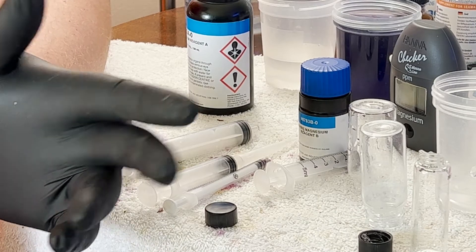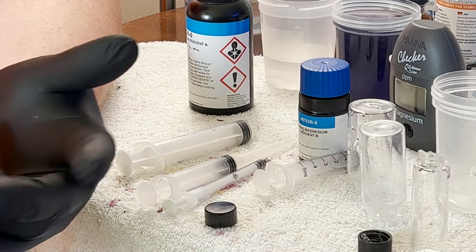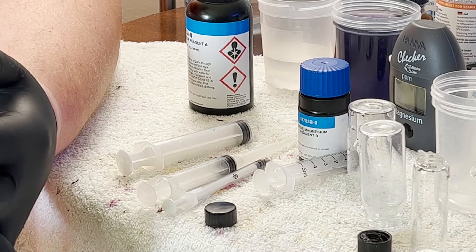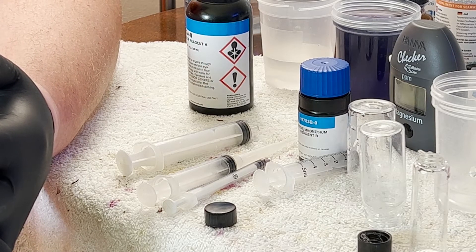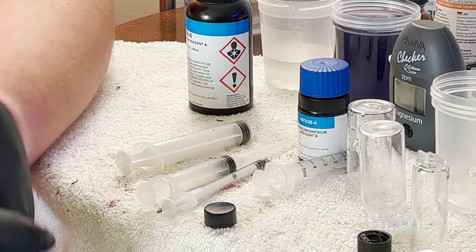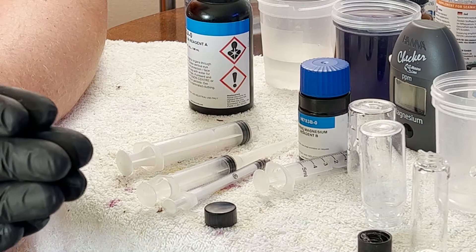I did probably 12 tests. I started — first one was 1400, then 1300, like 1320, 1310, and then 1220, 1210, 1211. It is very touchy on making sure that you do everything exactly perfect and exactly the same way every single time.